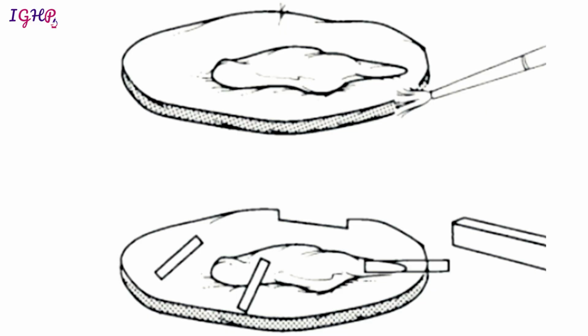So suppose we have an elliptical specimen like this, and this is the lesion which is seen on the surface. So there is always a dilemma: how should I cut it? Should I cut it like this, horizontal, or should I cut it vertically into serial slices? How should I cut it is a common sense question.